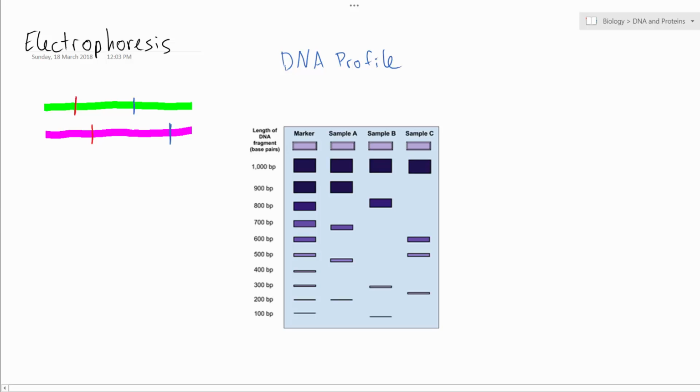So how gel electrophoresis works is the light blue in this picture here is a gel. So we make this gel and then we allow it to solidify in a bit of a block. What will happen is this end will attach to a negative electrode, and down the bottom here will be a positive electrode. So we run a charge through our gel.